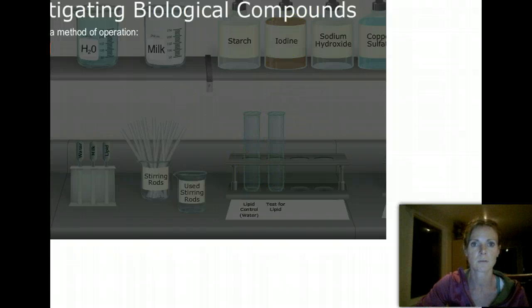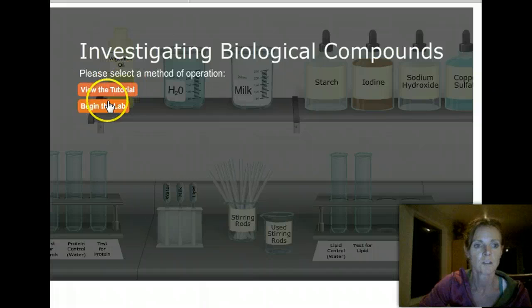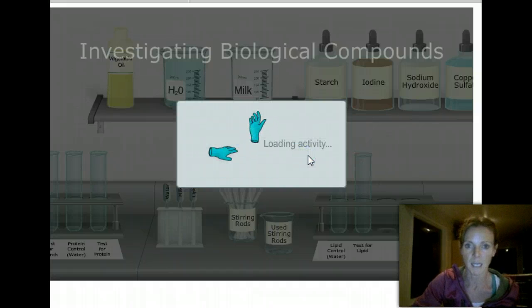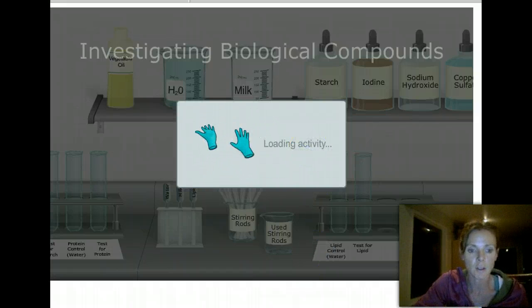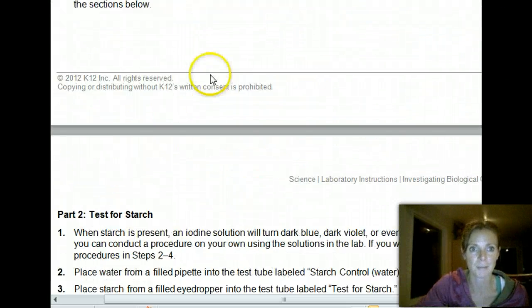I will try to pan around this. Sorry, I've got to move that around. You want to do the tutorial first, because that tells you what to do. So pick your color gloves, okay? And it's not hard, you follow the directions in your lab instructions.